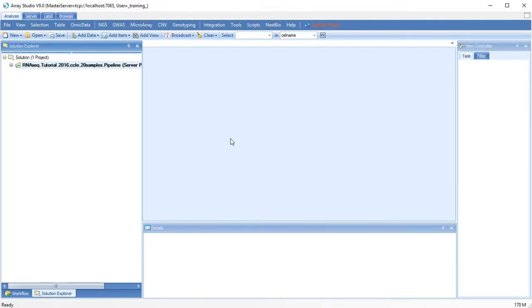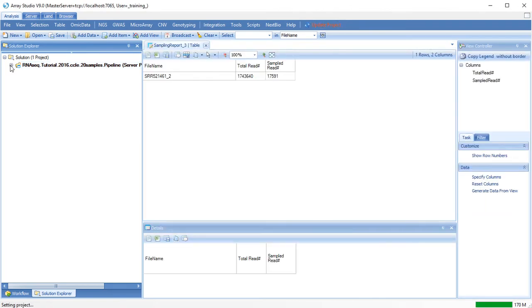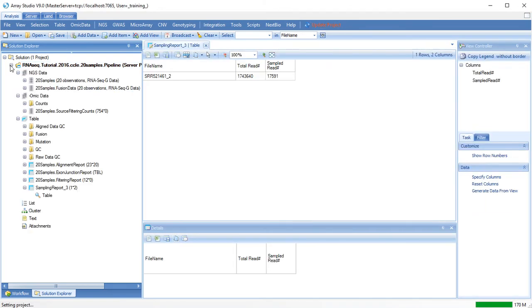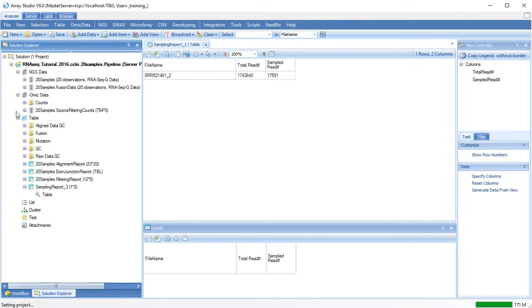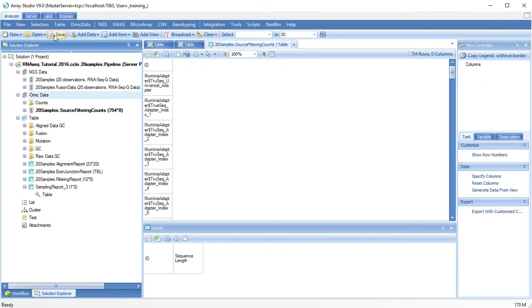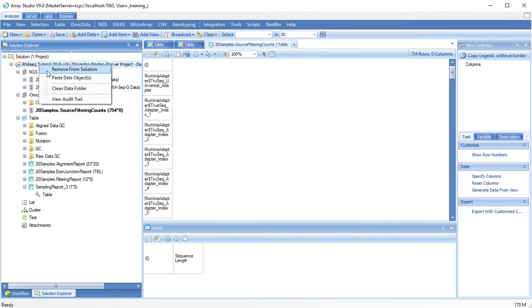When the pipeline analysis is complete, you can click Update Project, and find all of your new data objects under your project solution. At this point, you can save your project, or close the solution to be opened at a later date.